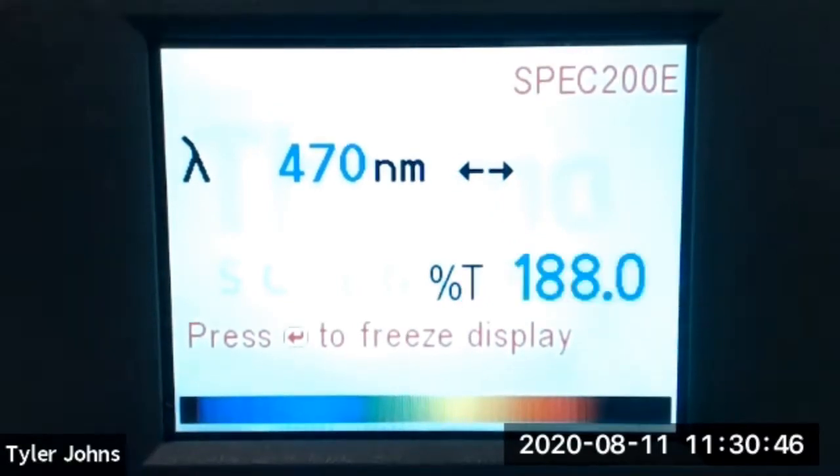You now need to convert your % transmittance readings into absorbance. You can then create a standard curve of absorbance versus concentration for your standard solutions. This concludes part 1 of this experiment.